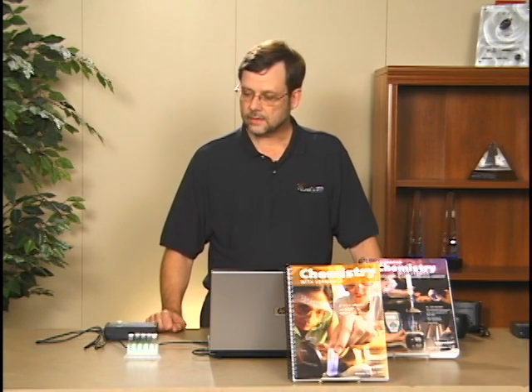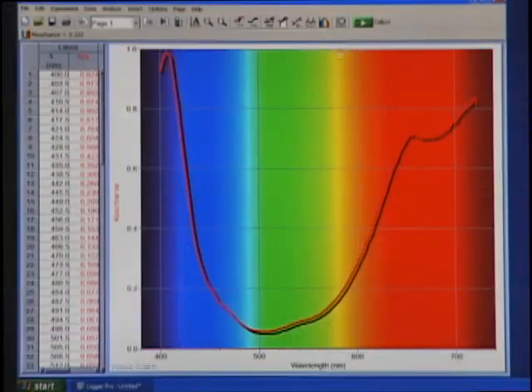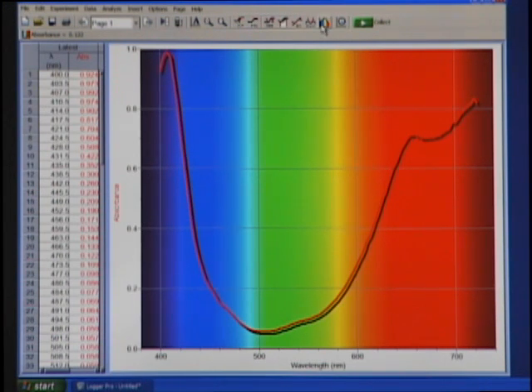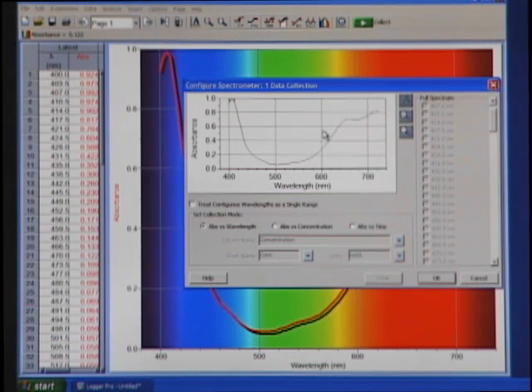Now what I want to do is change to a different mode of data collection. This mode that I'm currently using is called full spectrum, and I want to change to something in Vernierland that we call events with entry. Events with entry just lets me put in these five samples and take readings at my own pace and not have to do that against the clock. To access that mode, I'm going to go up to the left of the Collect button over to where I see the Configure Spectrometer icon, and I'm going to click on that.